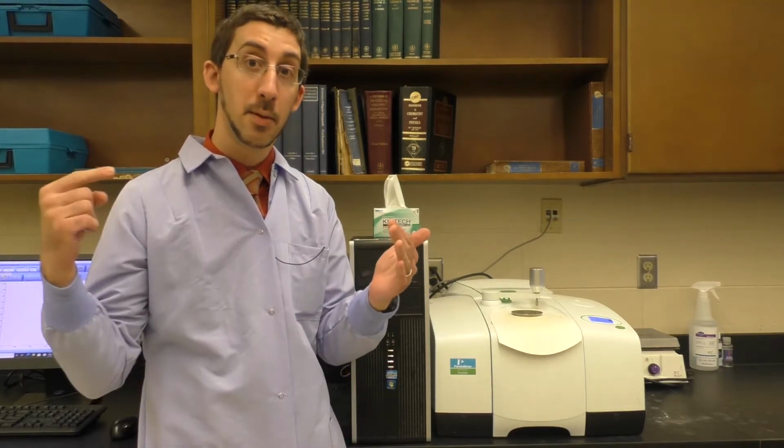That will put it in contact with a crystal that light passes through, and the interactions between the light that's passing through the crystal and your sample that sits on top of that crystal is where we get our absorptions in the IR spectrum. This is a little bit different from an absorption spectrometer that actually has to pass light through the sample to get to the detector.